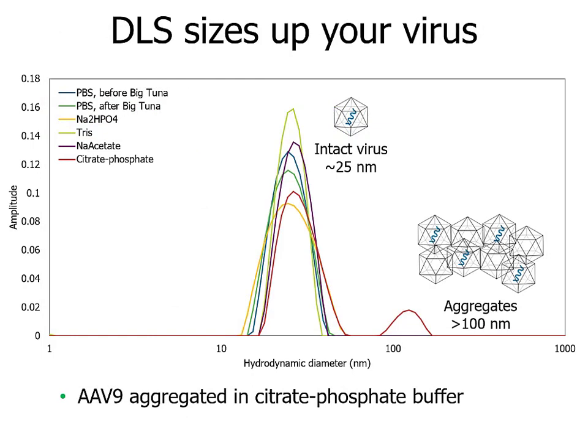DLS is a great way of looking at a quick snapshot of your virus sample quality. Intact viruses are about 25 nanometers in size. For most of our buffers, you can see just that single peak at about 25 nanometers in the DLS intensity distribution, indicating all the virus was intact, nicely monodispersed, and non-aggregated. However, if you look at the red line — the citrate phosphate buffer — you can see a second peak above 100 nanometers, corresponding to aggregated samples. AAV9 aggregated most in this acidic citrate phosphate buffer, which also explains the lower than expected percent recovery by ELISA. The ELISA is sensitive only for intact viruses and doesn't bind AAV aggregates, so a significant portion of the AAV capsids locked in aggregates weren't detected.